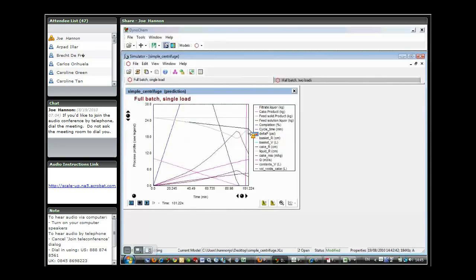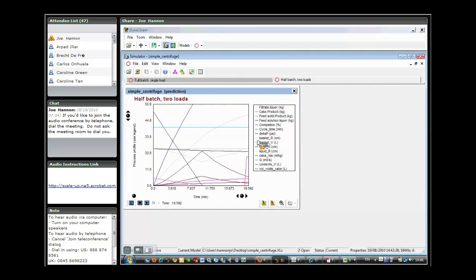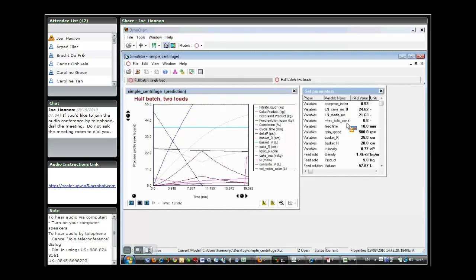That's the single load, 90-minute feed. We also have here the half batch size, which would be two loads. This can actually be fed a lot more quickly because the total batch size occupies a lot less volume inside the centrifuge. In this case, if I just look in set parameters, feed time is just 10 minutes as opposed to 90 minutes with a full load.